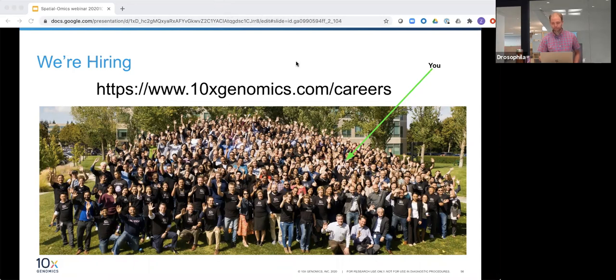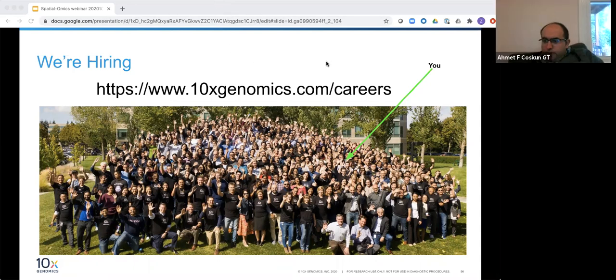Okay. Really nice talk from Caleb Stolzfus. I think the spatial clustering is very powerful. Do you have ways to interrogate these regions in depth beyond region composition, like distance to region type, or how much regions interact with or border each other? This could tell for tumor which immune-rich regions are bordering tumor regions.